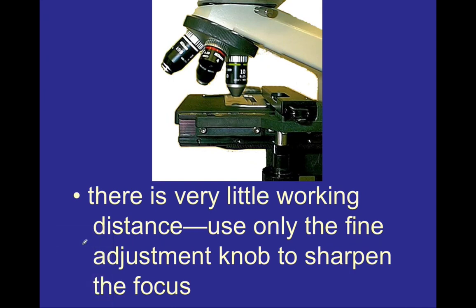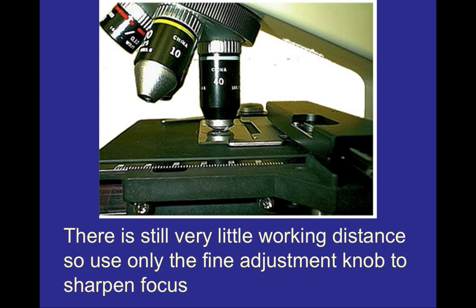Once you have gotten your microscope slide in focus with the scanning objective lens, you are ready to switch to the low power objective. The working distance is drastically decreasing as we change these objective lenses — there was much more working distance with the scanning objective than with the low power objective. This is why you should only use the fine adjustment knob at this stage, because using the coarse adjustment knob will drastically put your picture out of focus. As we progress to the high power objective, the working distance decreases even further — there is a very small distance between the high power objective lens and the microscope slide when in focus. This is what we mean when we say microscopes are parfocal: all objective lenses are roughly in focus, and as long as we only use the fine adjustment knob, we will stay within the right focal range.